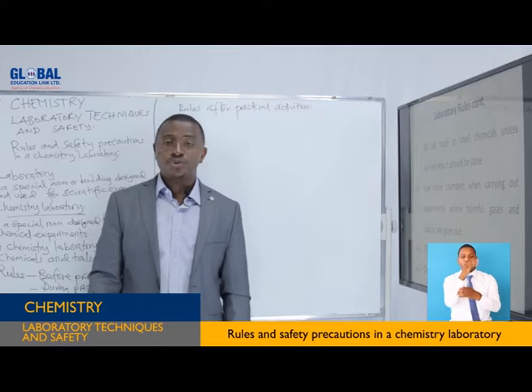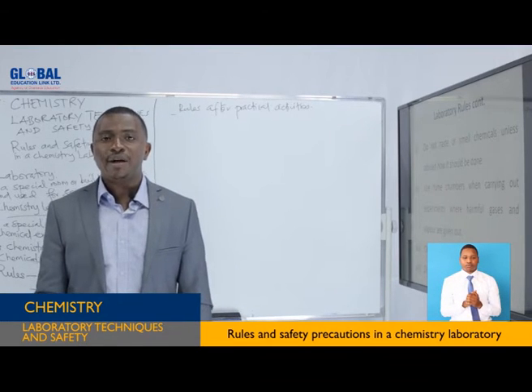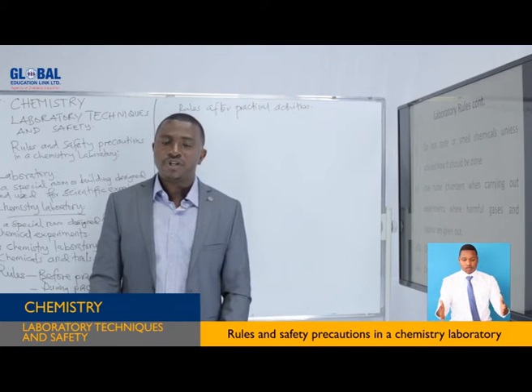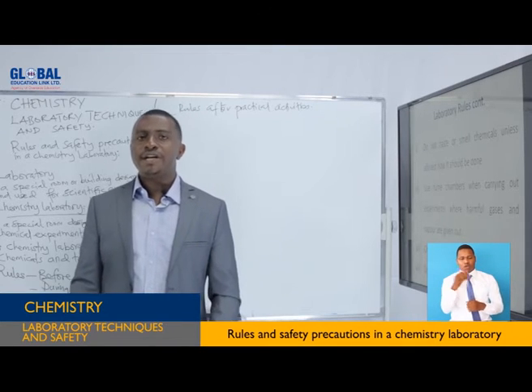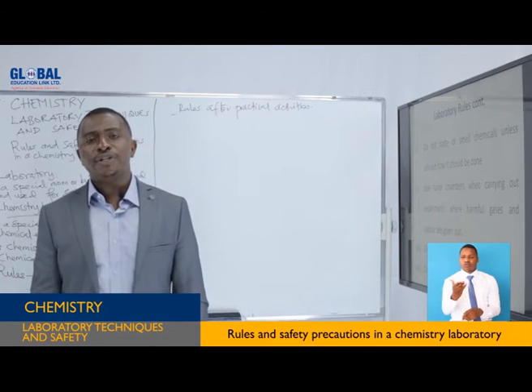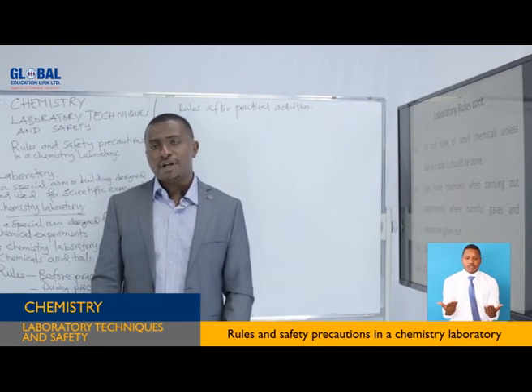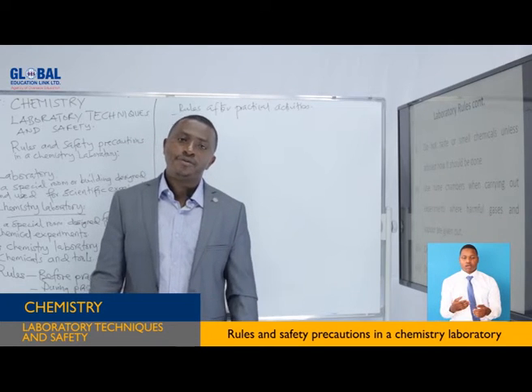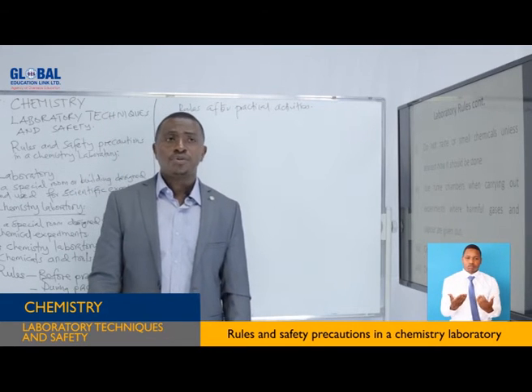So please, you should not work on the open benches within the laboratory. Conduct your experiment that you know can lead to poisonous gases within the fume chamber. It's because if someone inhales these poisonous gases, or these harmful gases, it can lead to some harm, discomfort or irritation, and it can also lead to loss of smell.